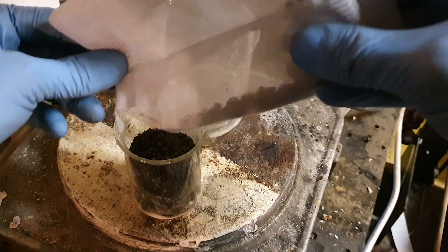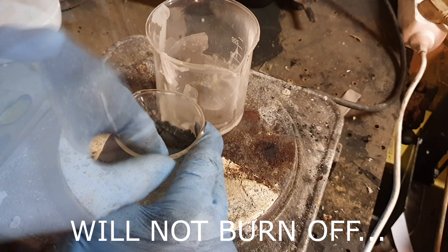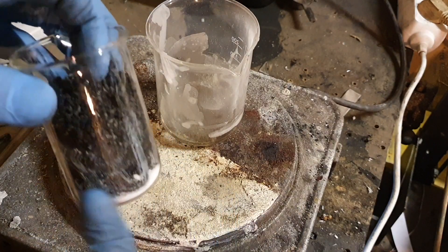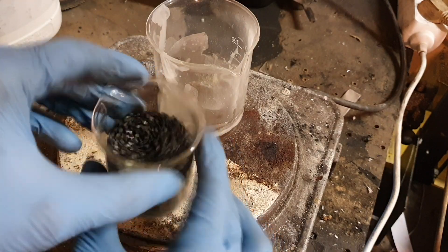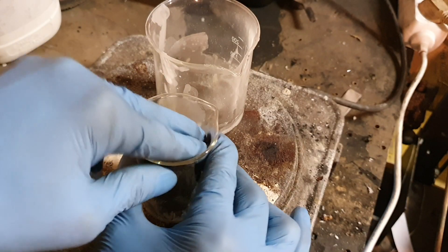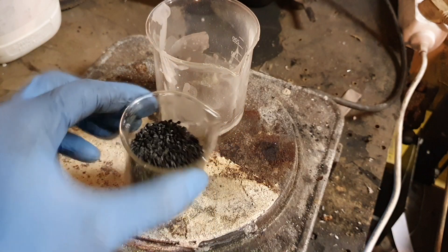This activated carbon will prevent the graphitic carbon nitride from burning off. So on the bottom I have some urea which is not melted yet, then I have my carbon felt which is soaked with molten urea, and on top of this carbon felt I put another carbon felt, and then I fill this cup with activated carbon to prevent the graphitic carbon nitride from burning off.